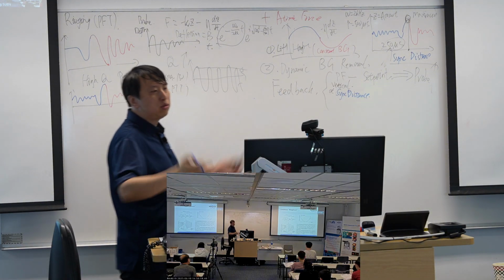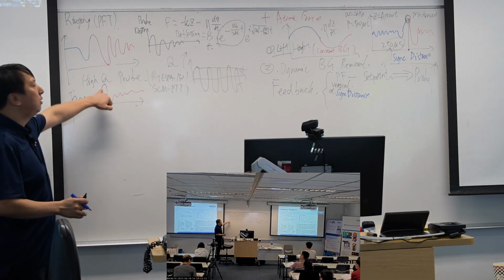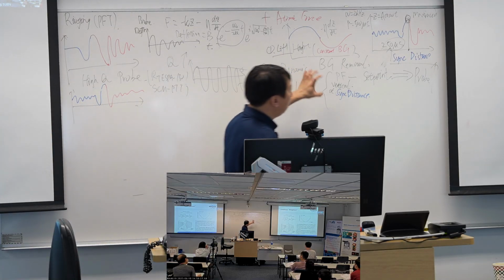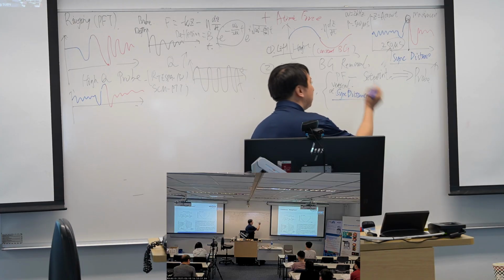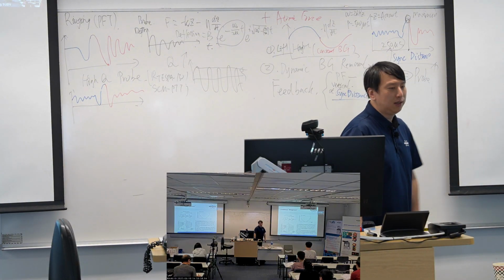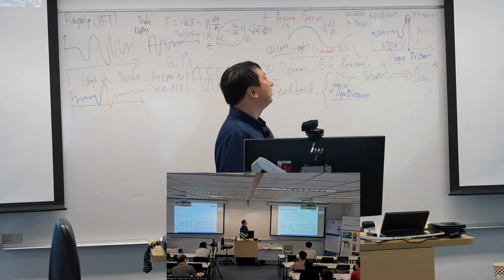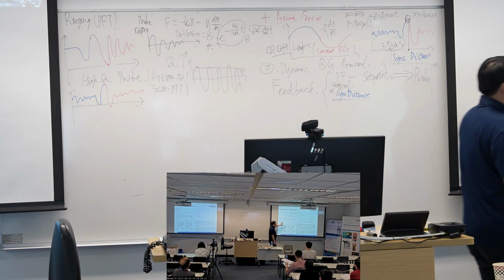Then I don't need to use any mechanism, any algebra to calculate the maximum force. I just take a value at a certain time point, and that's the sync distance. And with that, we can easily do the feedback thing. Okay, so that's the whole idea of PeakForce tapping.